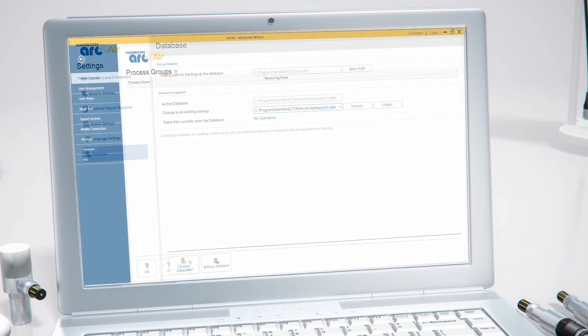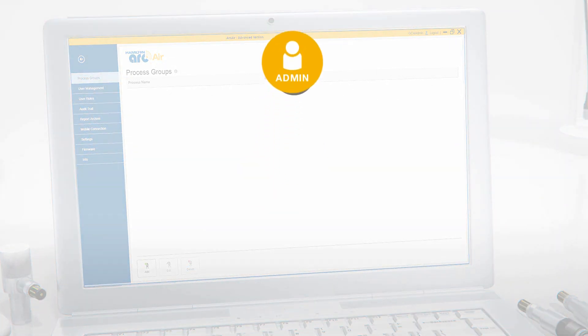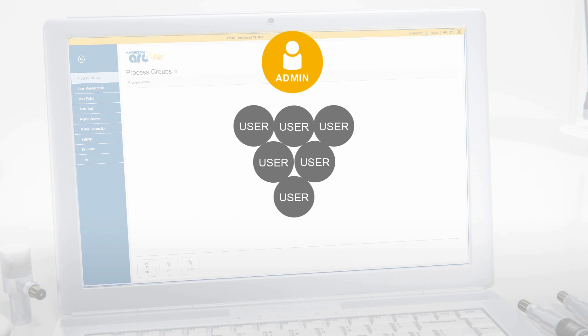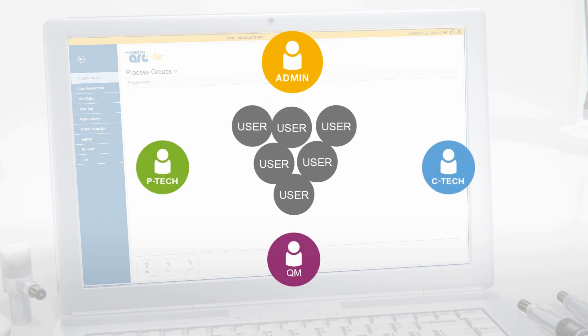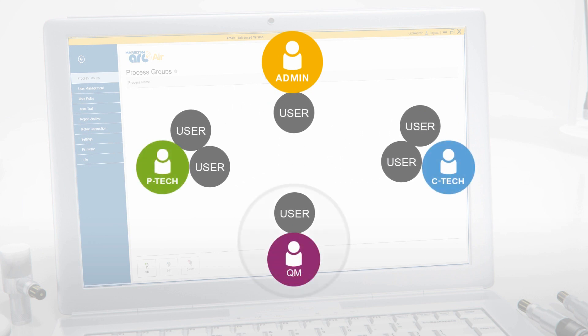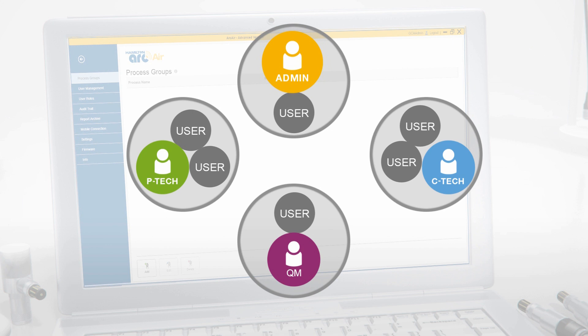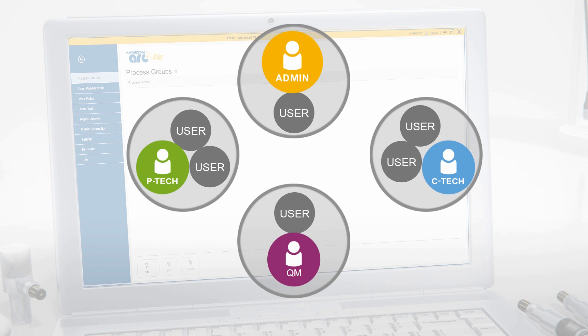ArcAir software enables administrators to create optional user accounts and assign them to predefined user roles with different access levels for enhanced security. By default, ArcAir provides four user roles: administrator, production technician, calibration technician, and quality manager. If necessary, the administrator can create customized user roles as well.